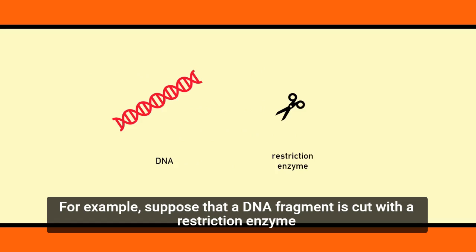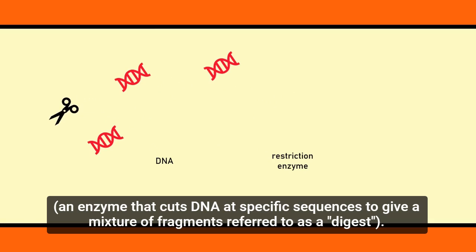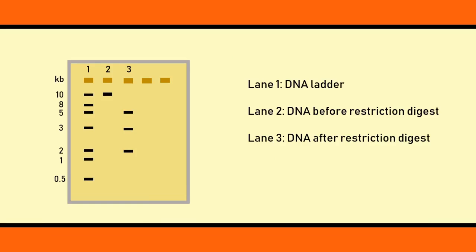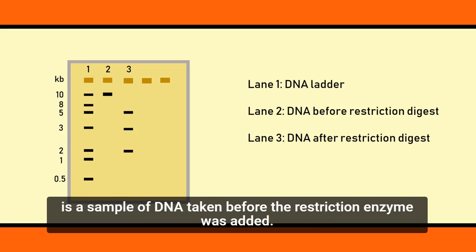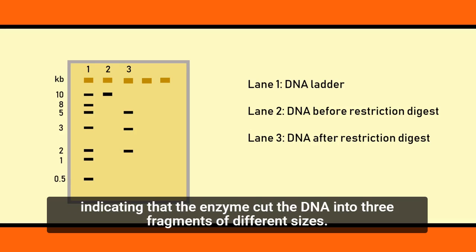For example, suppose that a DNA fragment is cut with a restriction enzyme. A restriction enzyme is an enzyme that cuts DNA at specific base sequences to give a mixture of fragments referred to as a digest. A sample of the digest can be analysed by agarose electrophoresis as shown here. In lane 1, we have the DNA ladder. In lane 2, the single band of about 10 kilobases is a sample of DNA taken before the restriction enzyme was added. Lane 3 contains the digested DNA. We see 3 distinct bands, indicating that the enzyme cut the DNA into 3 fragments of different sizes.